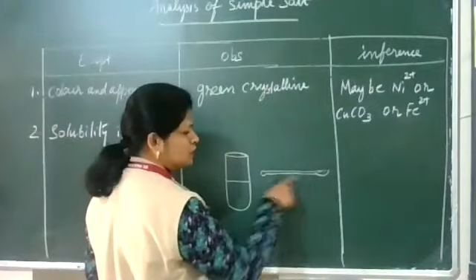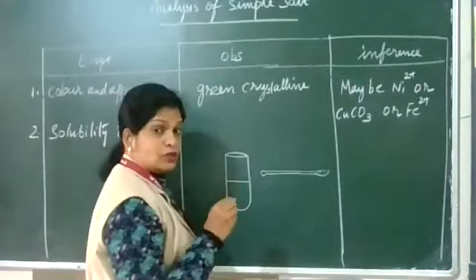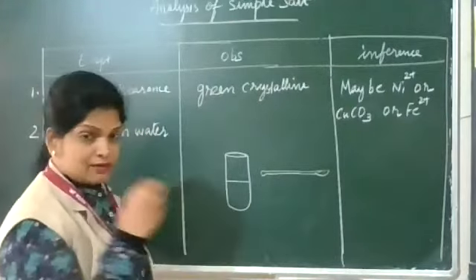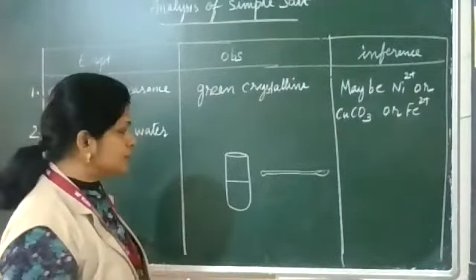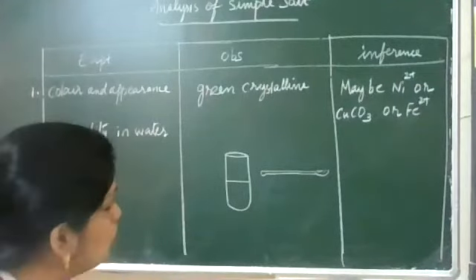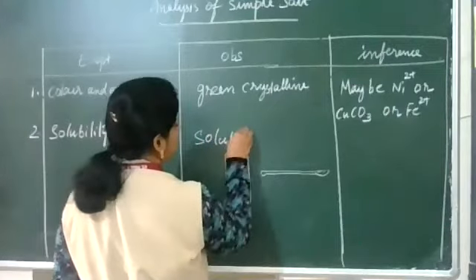So using this spatula, add the given salt to the water and shake it well. If it is completely soluble, then we write soluble in water.